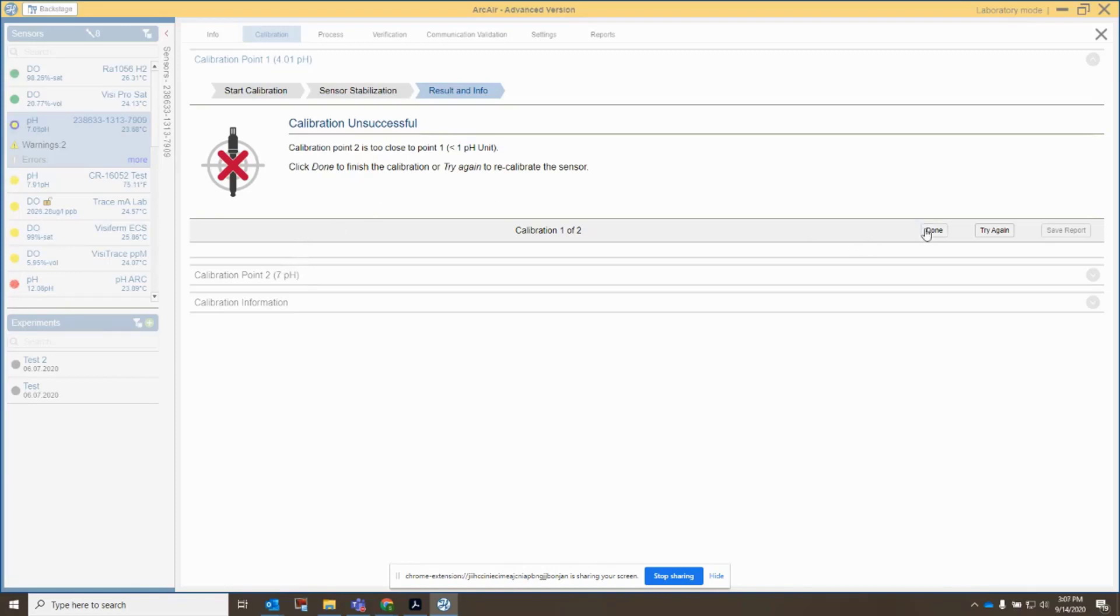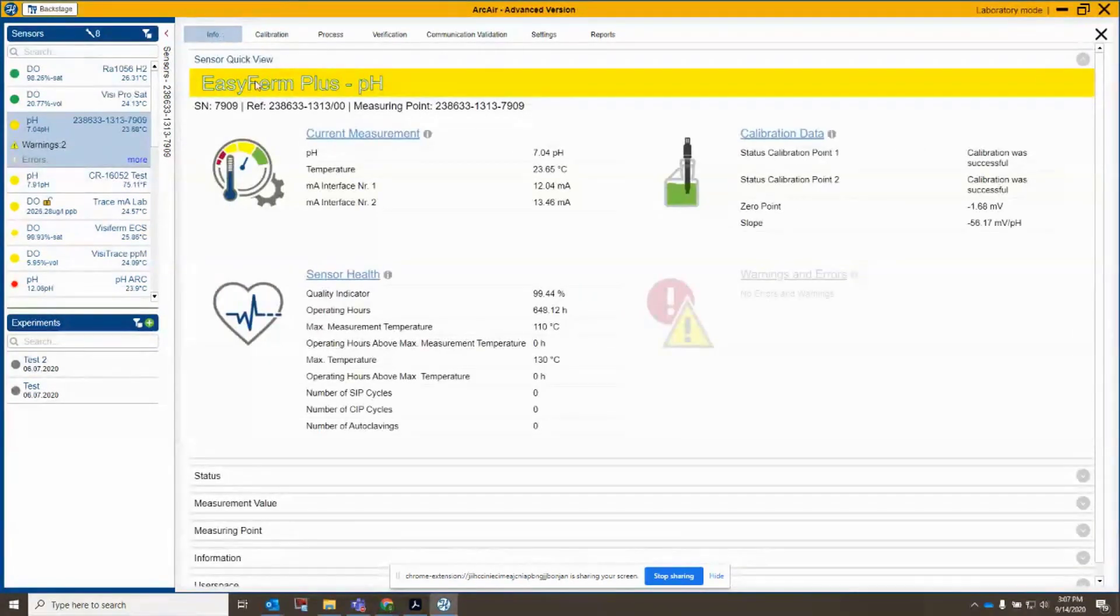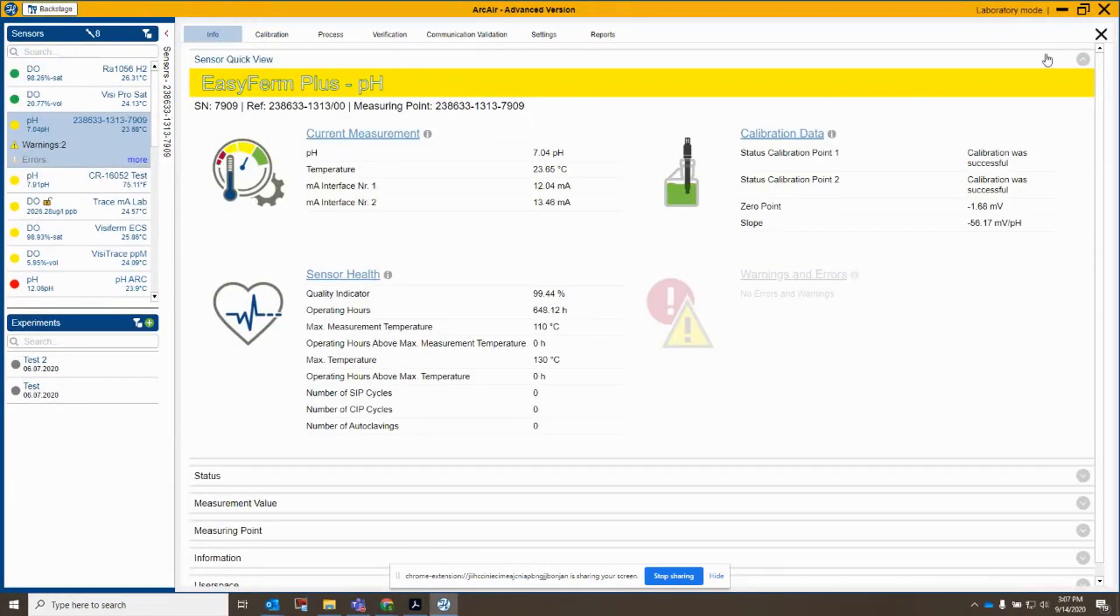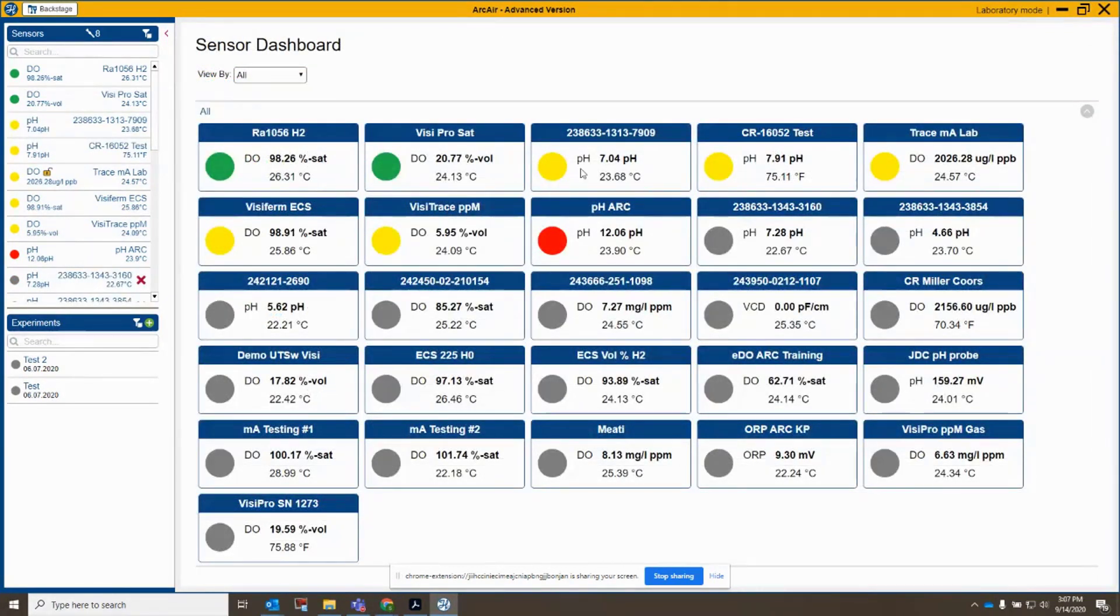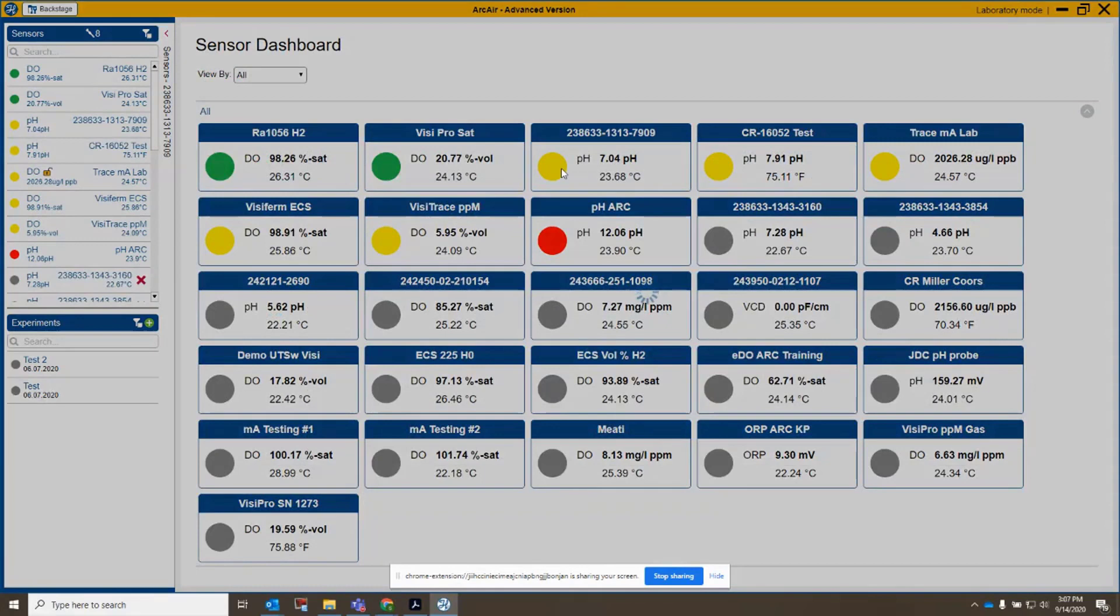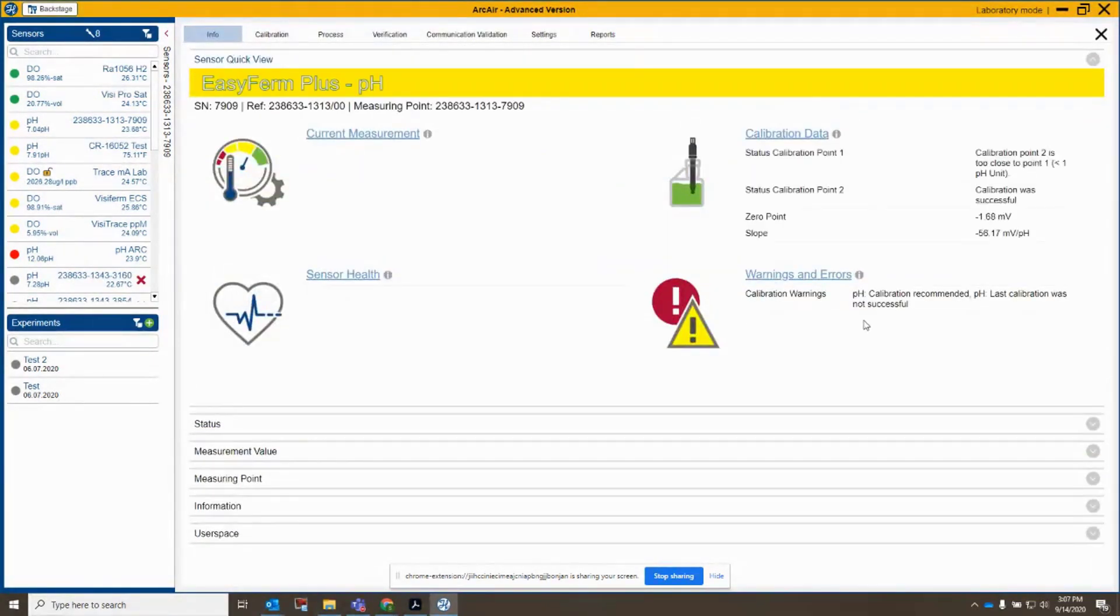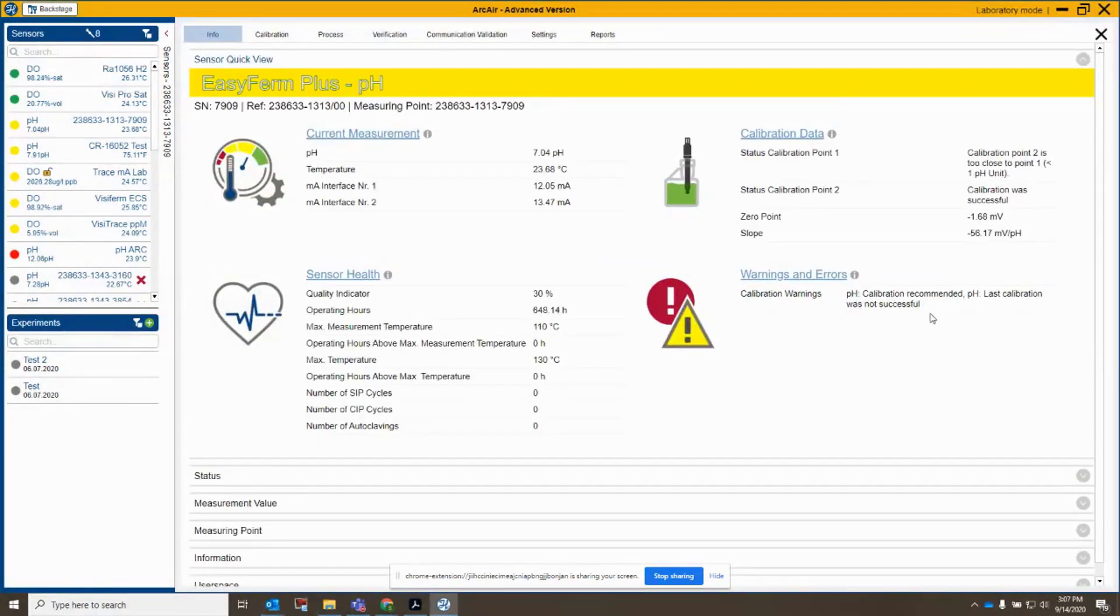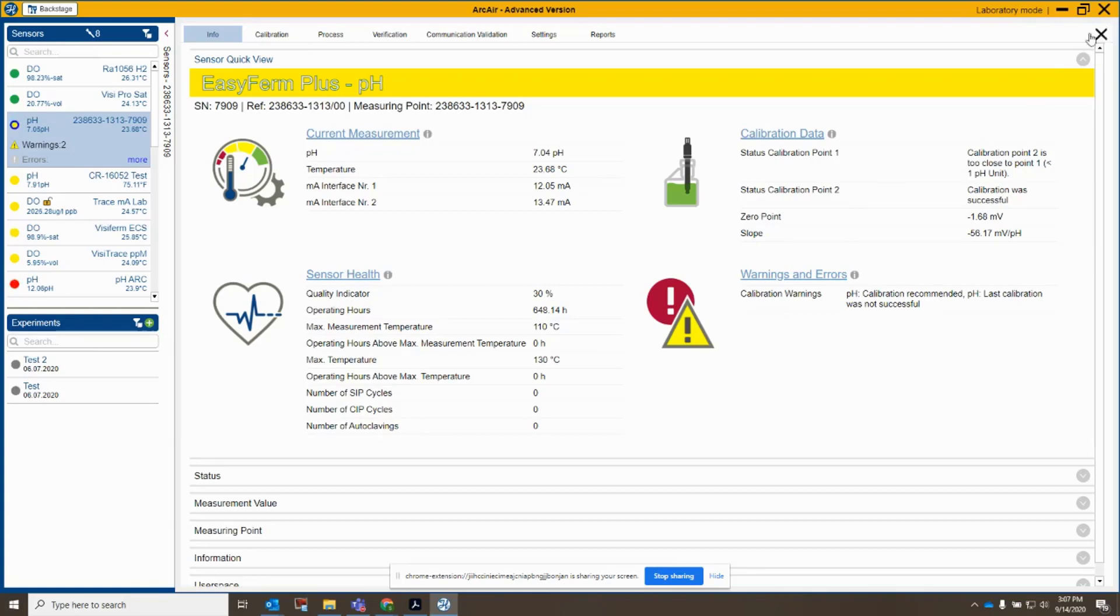The other thing, if I go out of this and go back and look at my sensor here, it's now yellow, and if I click out, click back in here, I'm going to get an error message here. It says pH calibration recommended because the last calibration was not successful, and now we know why. Okay, so let's try this again.